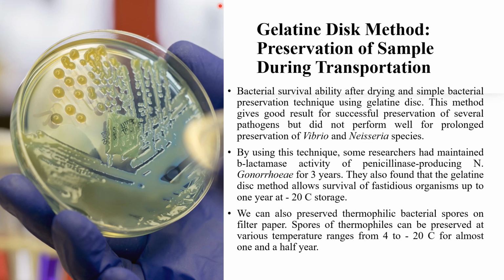There is no direct report on the use of the gelatin disc method for preservation of intact microbiome, but due to its capacity to maintain viability and functional stability of a number of bacterial strains, researchers might expect this technique as a possible alternative for long-term preservation of the microbiome.